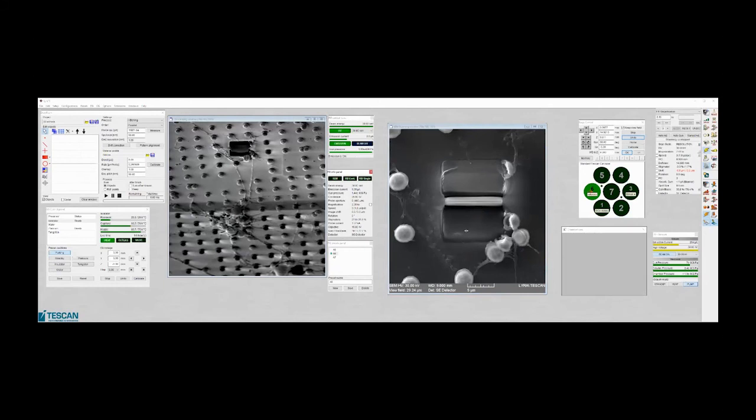So we are seeing it from the top. But the focused ion beam is now 55 degrees to the sample holder, but it's not 55, it's from the back. So you can see a back part of your sample here.